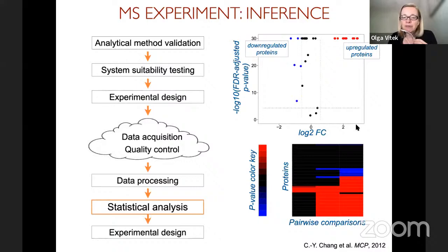However, log fold change alone is not a good criterion on whether this change that we observe is more systematic than what we expect to see by random chance. We need to compare this fold change to the extent of the underlying biological and technological variation, and p-values allow us to summarize that. So here, p-values are adjusted for multiple testing. I will talk about this in a minute.